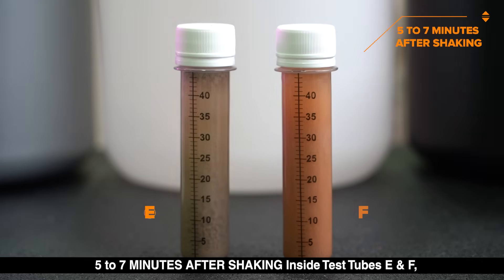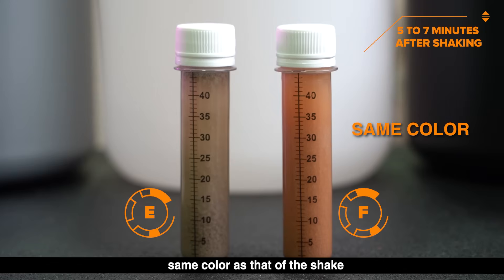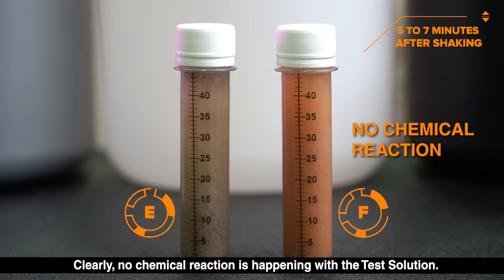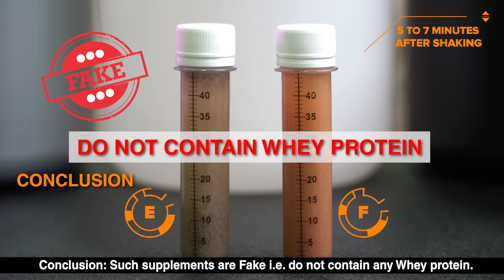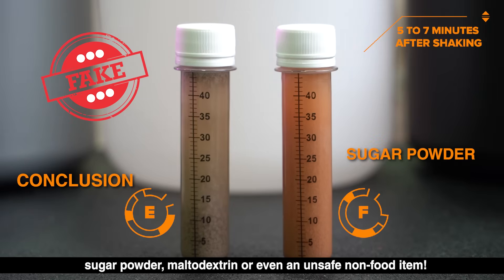Five to seven minutes after shaking, inside test tubes E and F, the mix is still uniformly spread without any separation or precipitation — the same color as the shake. There is not much difference from the first observation taken five minutes ago. Clearly no chemical reaction is happening. Conclusion: such supplements are fake — they do not contain any whey protein. These could just be some carbohydrate, flour, starch, sugar powder, maltodextrin, or even an unsafe non-food item.